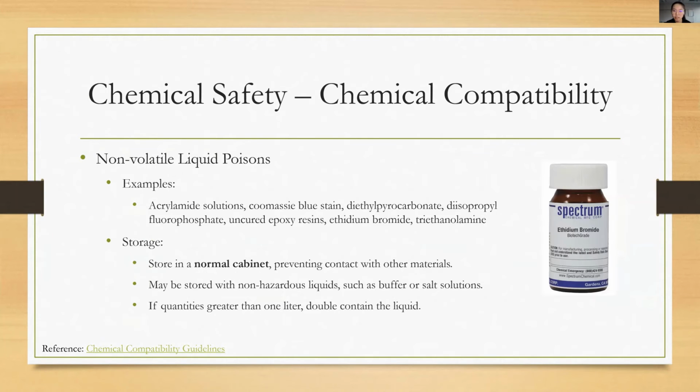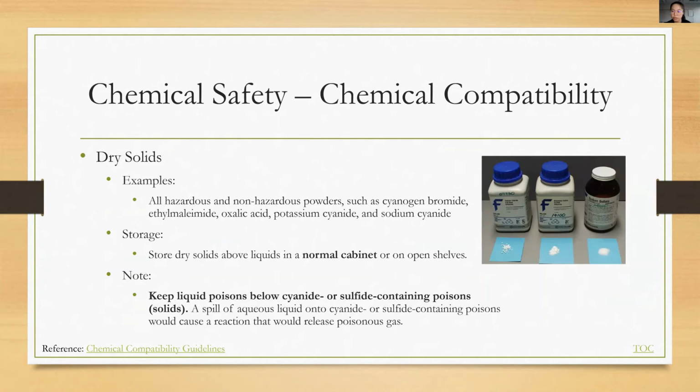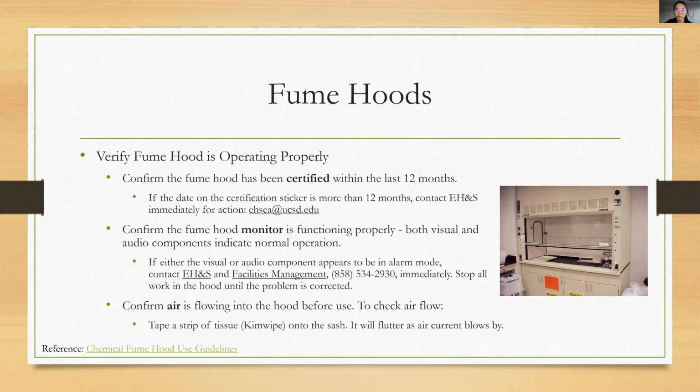Okay. The last two items are the operation of fume hoods and the biosafety cabinets. Our department and the operators of the fume hoods are responsible for letting me know when the fume hoods and biosafety cabinets need to be serviced annually.